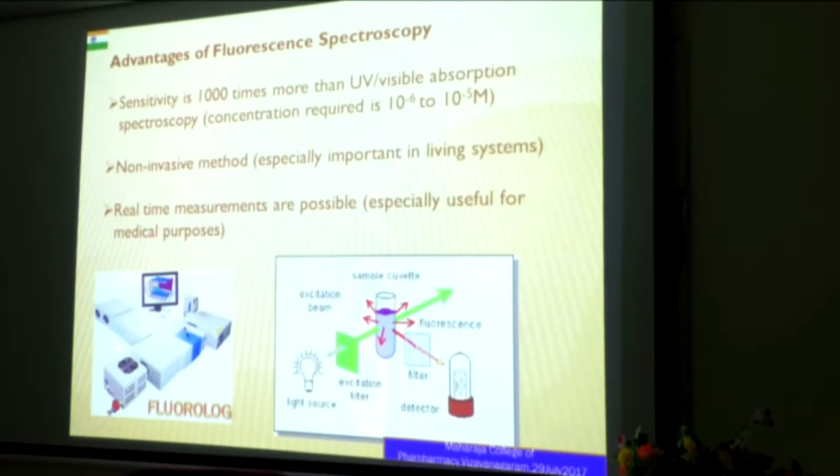This is the kind of luminescence spectrometer that we have. Probably Agilent, the person who is here can also show it. We have purchased one Agilent luminescence spectrometer also. It's similar, but this is much bigger than that. So this is the light source, a 450 watt xenon arc lamp, a very high intensity lamp. 450 watts, okay?